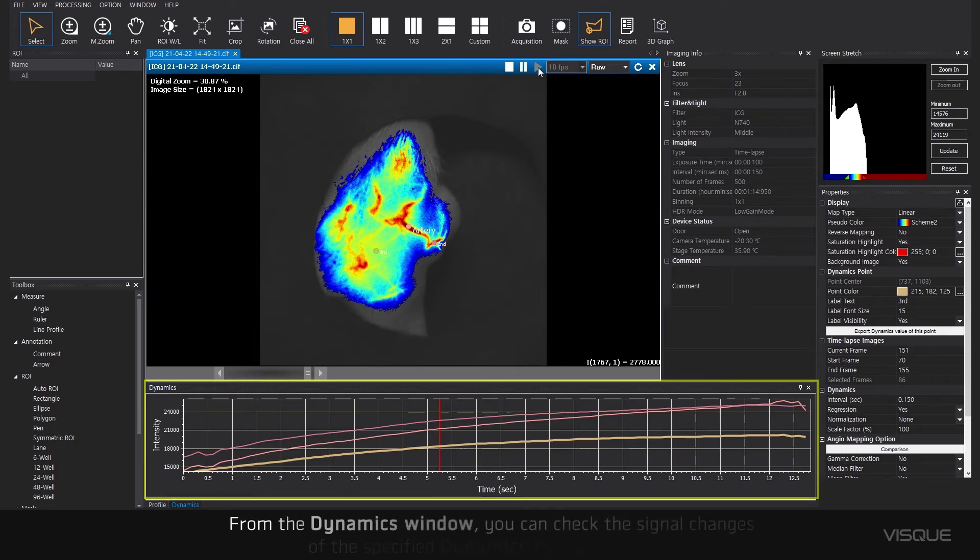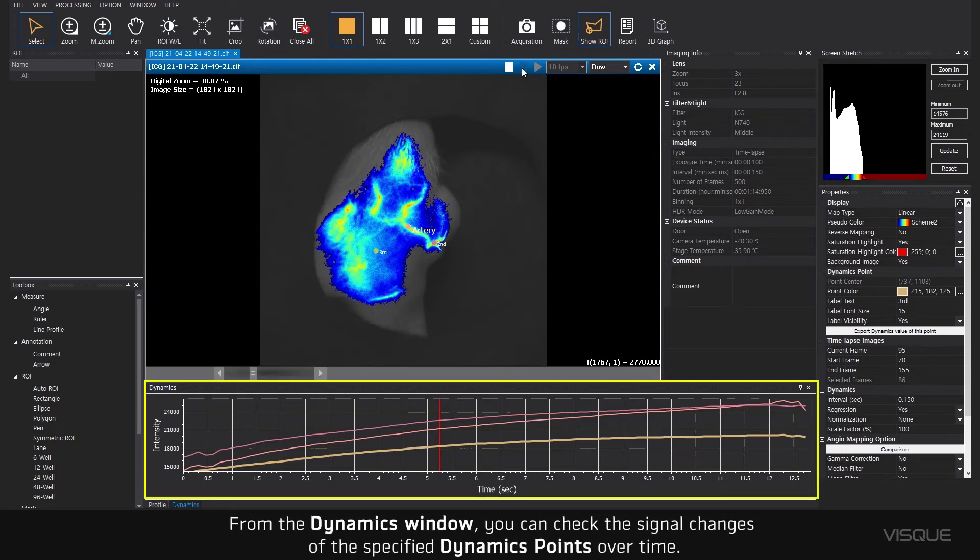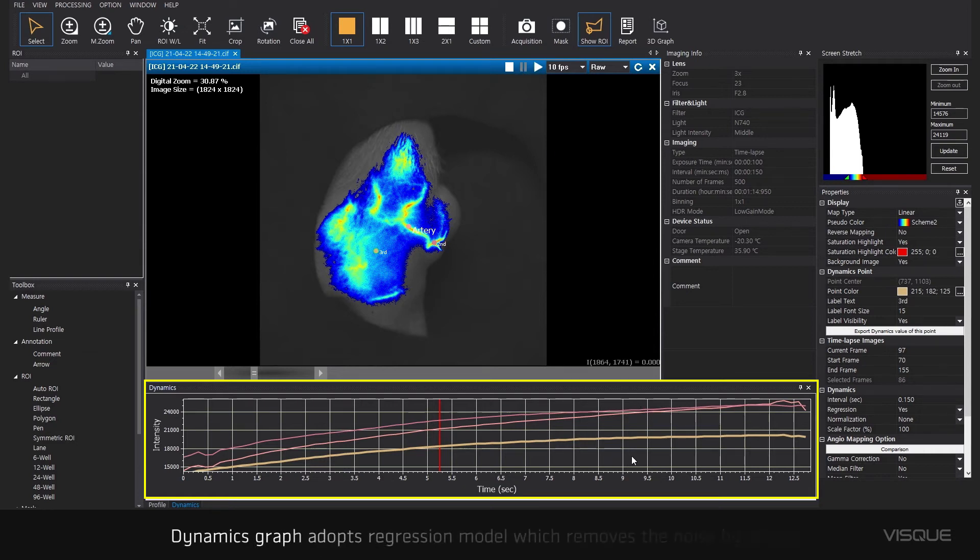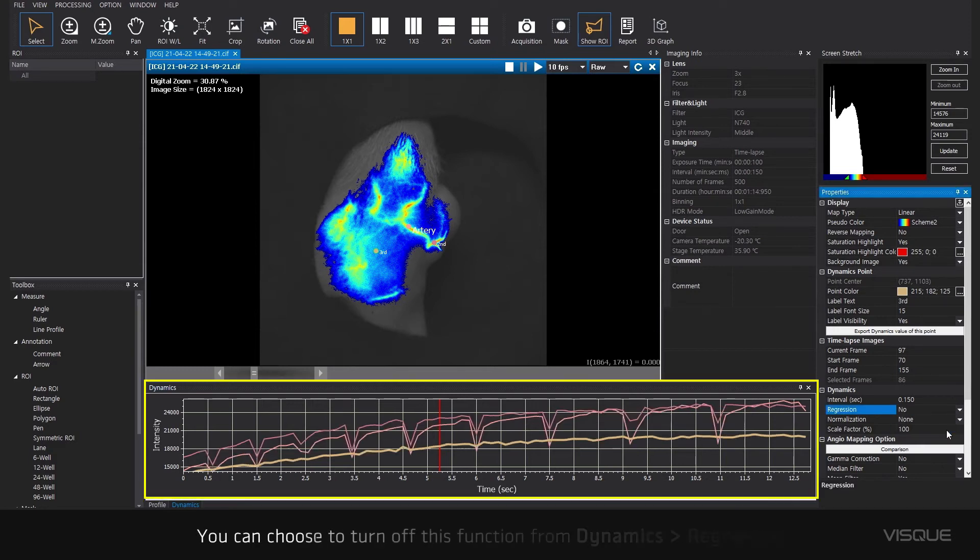Select the dynamics window. From the dynamics window, you can check the signal changes of the specified dynamic points over time. Dynamics graph adopts regression model which removes the noise by default. You can choose to turn off this function from Dynamics Regression.